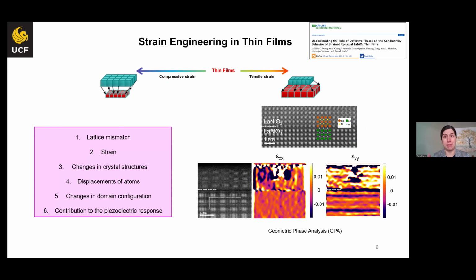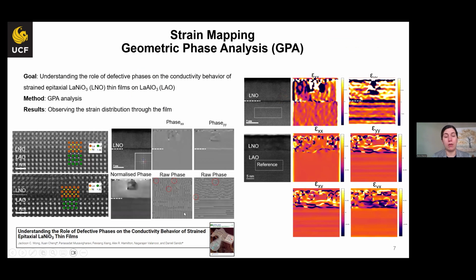Here you can see whenever we have a thin film on top of a substrate, because we have lattice mismatch, of course we have strain. It can be either compressive or tensile. And it's very important for us to measure this strain. With a very simple technique, we can measure this strain by measuring the distance between atomic planes using different software. For example, one of them is called GPA, where we have a reference area, as you can see here in the white box. And based on the reference, we can measure the d-spacing and compare it to that one. And as a result, we can map the strain. And this is what we did for LNO thin films before, I think back in 2018.